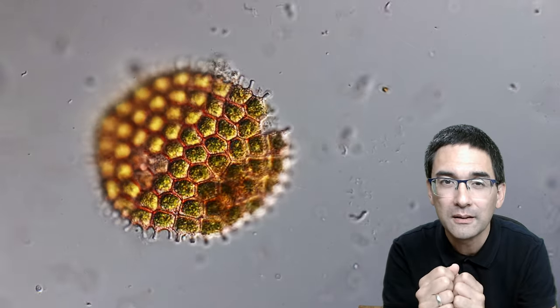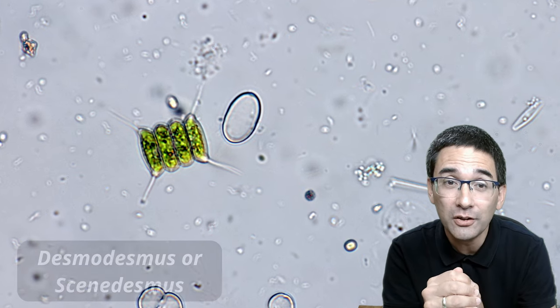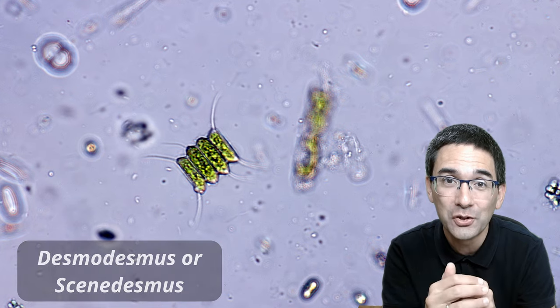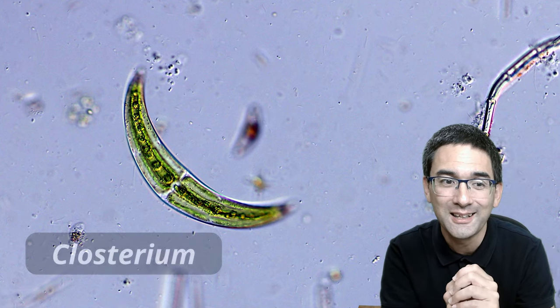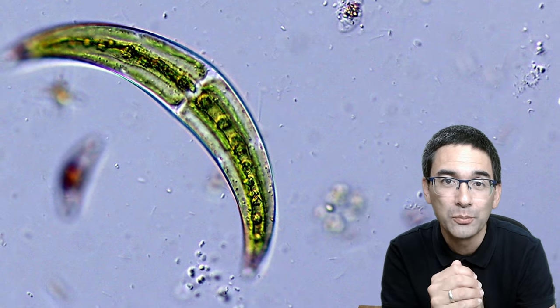It was actually a mistake that I made — I always leave the cap open. I had some identification issues here; there are two names that this organism goes by, but it's also one of the very common organisms that can be found. This one is a classic that can be found quite often in bodies of water that you observe.